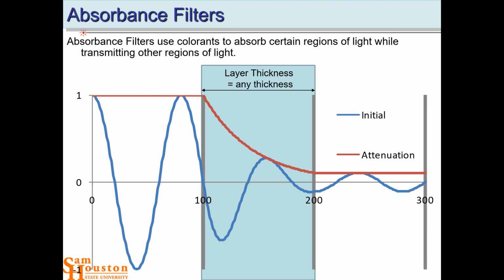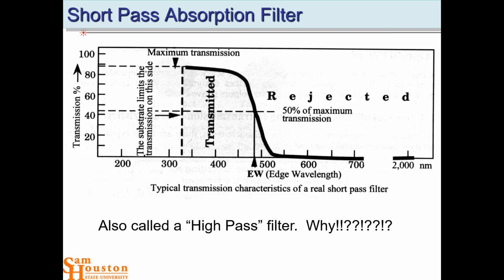And so where did this energy go? It goes into the molecules that are in the filter. So if you put a lot of energy in, the filter heats up. So you need fans. You need to cool those things with convective airflow.